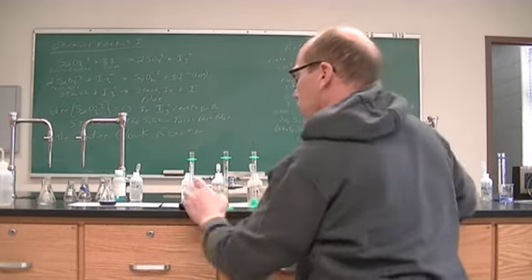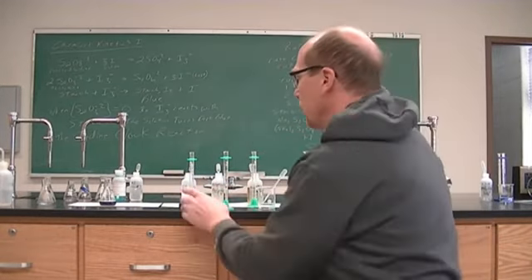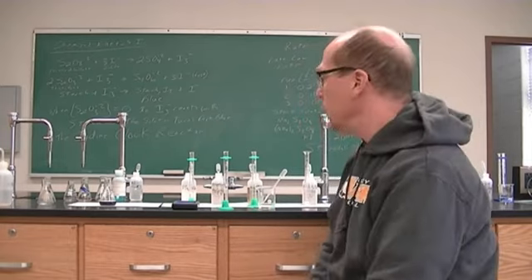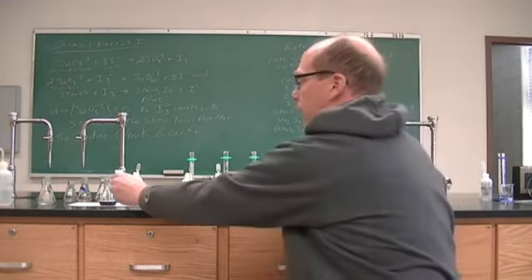Oh, and it turned blue. All right, so there is the blue color right there. And so I got 1 minute and 46 seconds. It was probably more like 45 seconds. But there is the dark blue color that we're looking for. All right, so we have run 1.